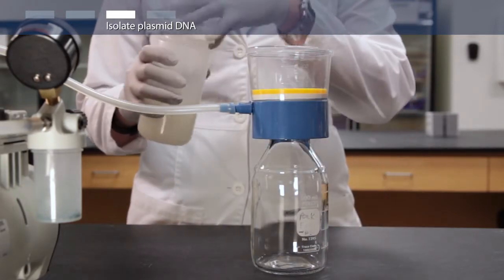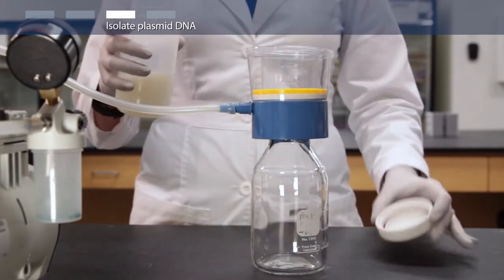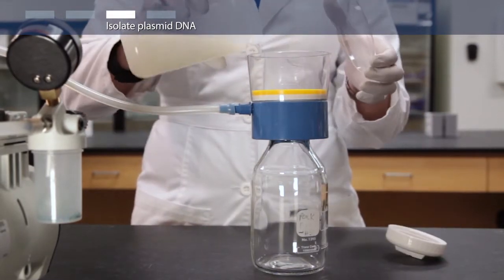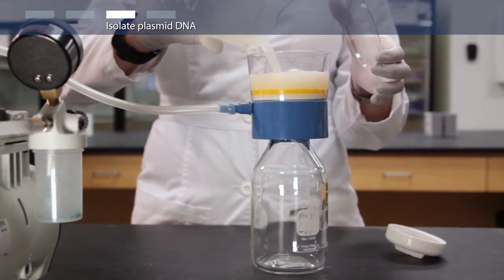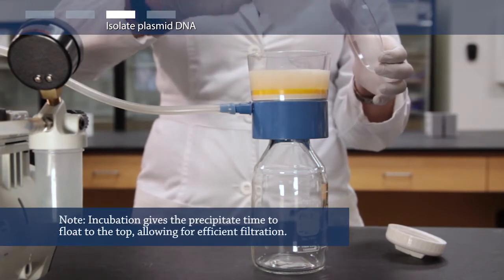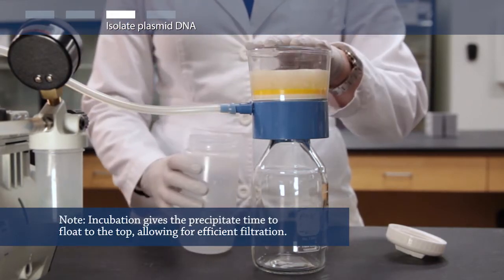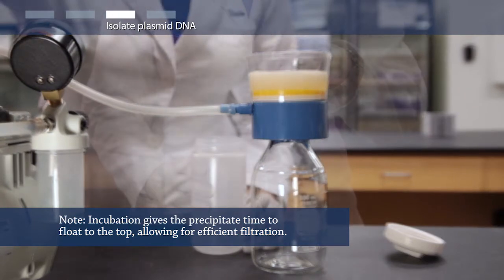To isolate your plasmid DNA, first pour the lysate into the lysate filtration cartridge which is already attached to a receiver flask and a vacuum source. Incubate for at least two minutes and then turn on the vacuum to filter the lysate.